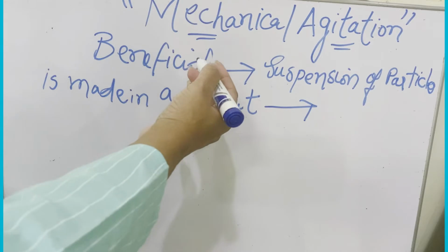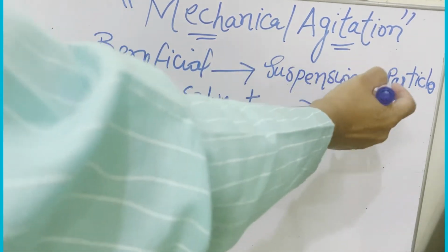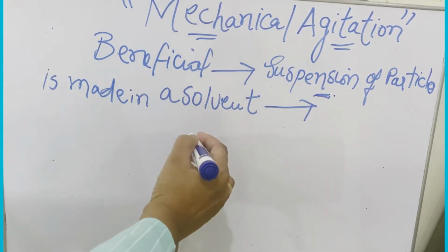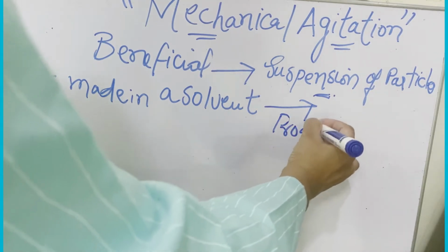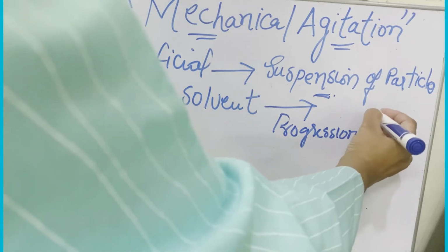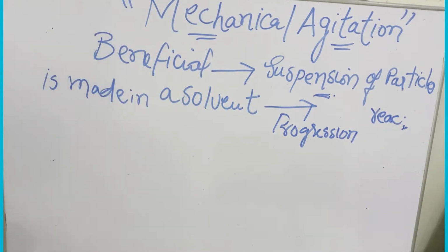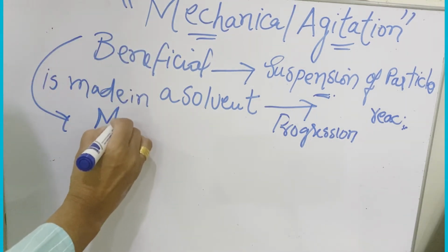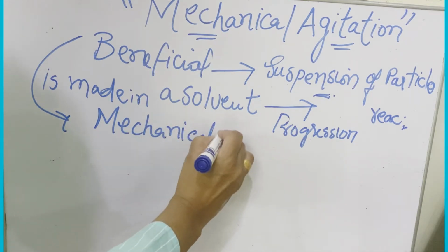It is beneficial when a suspension of particles is made in a solvent for the progression of the reaction. It is also called mechanical stirring.